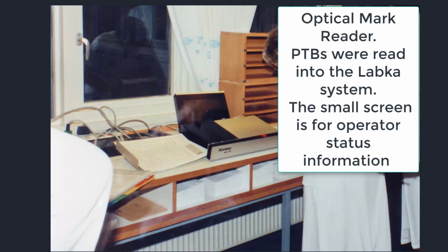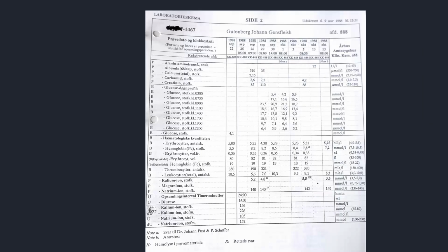The system also got cumulative printout, which you see here. It came in '88. Then the doctor could see the patient's many analyzed results in a manageable form, always sorted correctly in time. The new result is bolded. If corrected, data is marked with an R and bolded. There were footnotes, reference data, etc., helping the doctor to get an overview of the patient's data as a function of time. More about the growth of the entire system later.